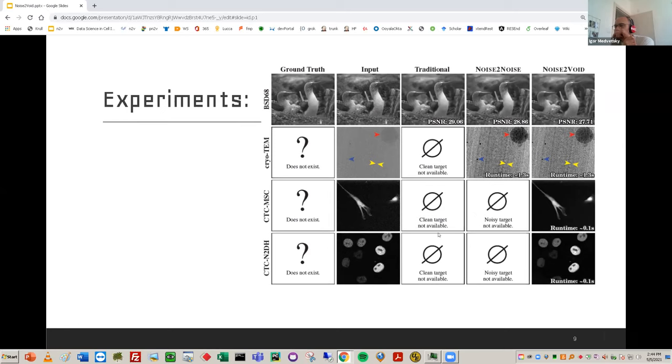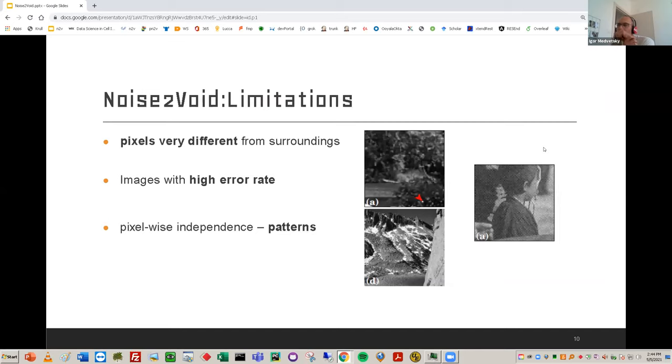And you can see, especially on the second line, a good improvement in picture quality. Noise is removed. You can see it on the left and on the right. Here we don't have measured numbers, only visual comparison, because we don't have a reference. Yeah. Okay, thanks.